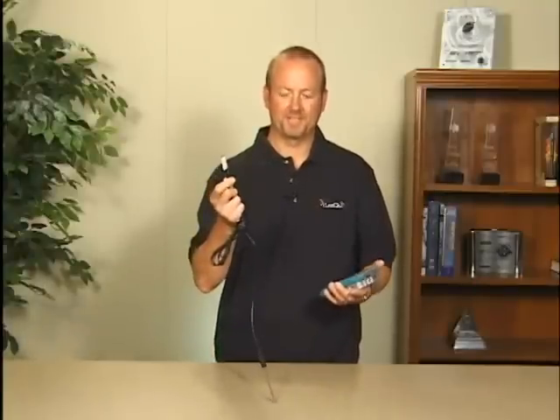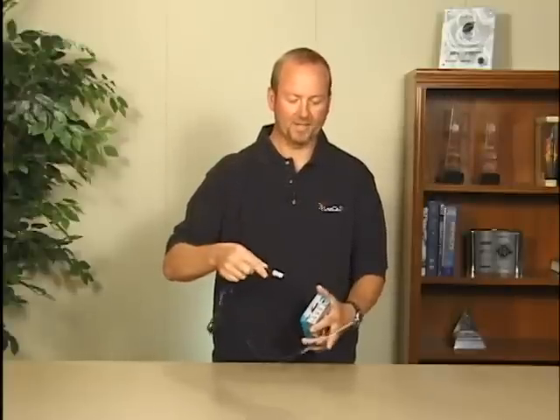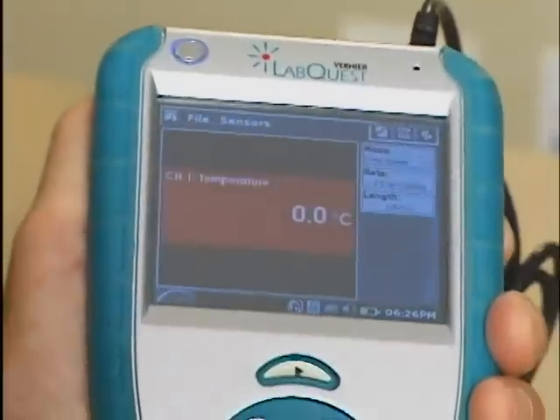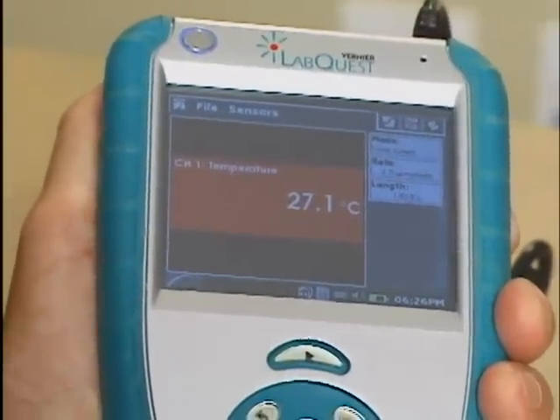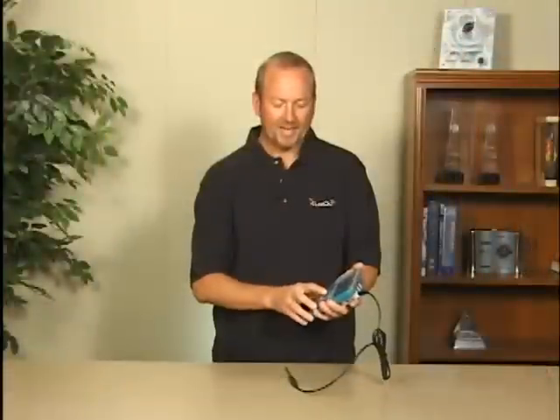For us, all we have to do is grab one of our sensors. This happens to be a temperature sensor. I'm going to plug it into channel one here. You'll notice it's automatically identified as a temperature probe and it's already monitoring the data. It's very easy to use.